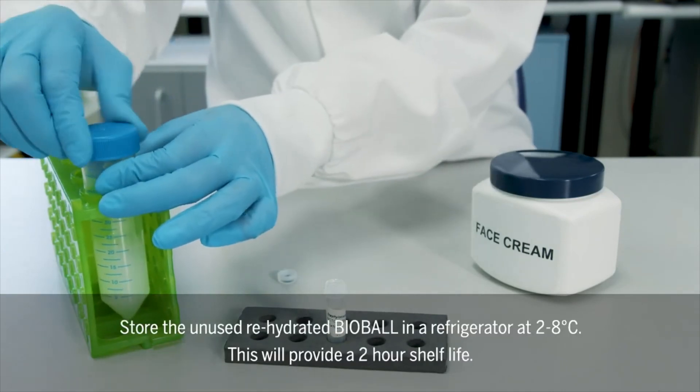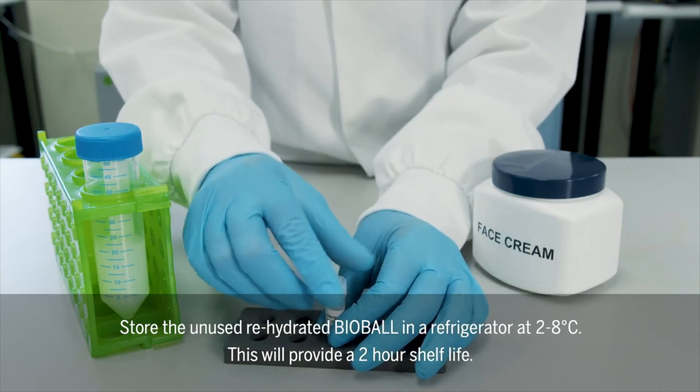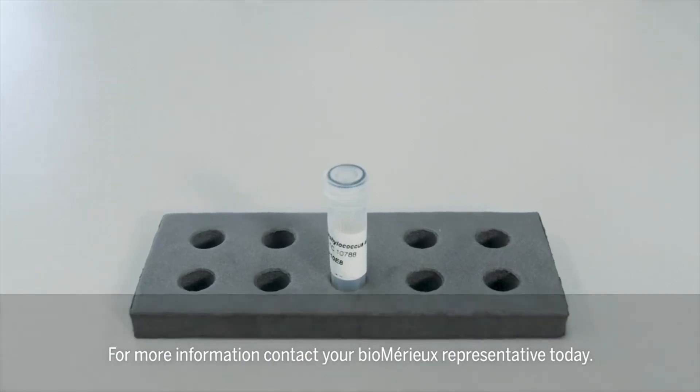Store the unused rehydrated Bioball in a refrigerator at 2-8 degrees Celsius. This will provide a 2-hour shelf life. For more information, contact your bioMérieux representative today.